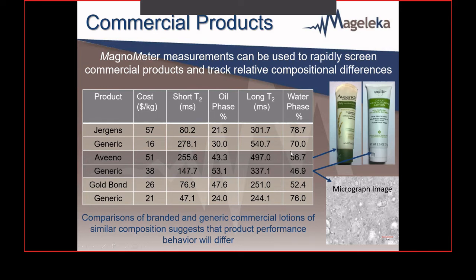And one more point is that although there's oil here, this is a micrograph literally of the Studio one, and I defy anyone to even work out where the oil droplets are. So you can't do easy analysis, but NMR can give you at least a fingerprint of what you've got. And the other point is that you can now use this to compare and contrast competitive products as a means to improve equivalency or the economics of formulations.